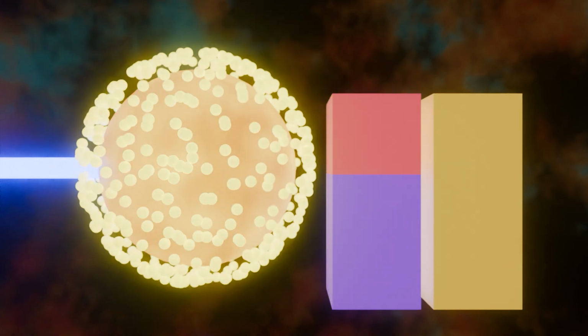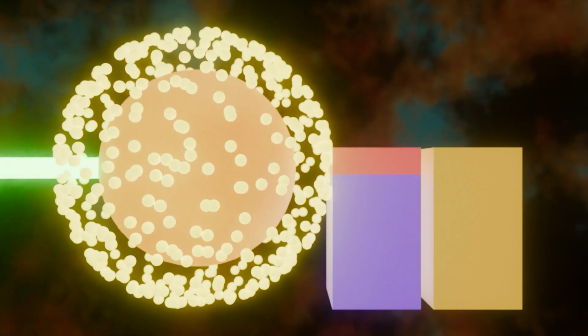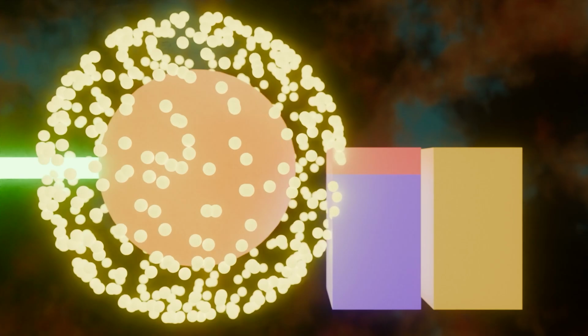Well, it will mean how quickly these electrons are moving away from our molecule. So for example, here's the low energy electrons, and here's the high energy electrons. Now you can see that after 2 seconds of simulation, here's the low energy, and here's the high energy electrons. So the size of the sphere goes up or down based on the energy.